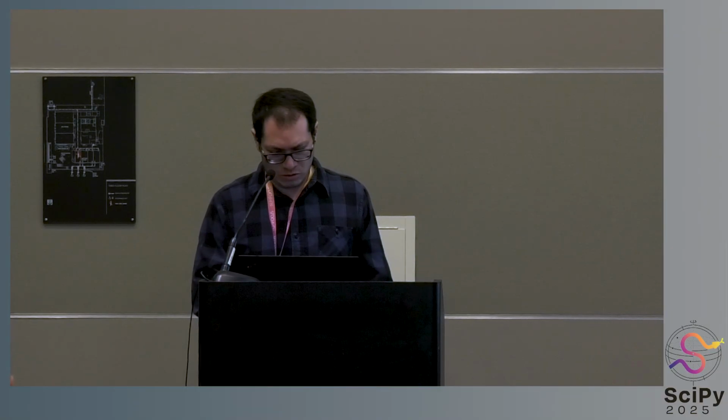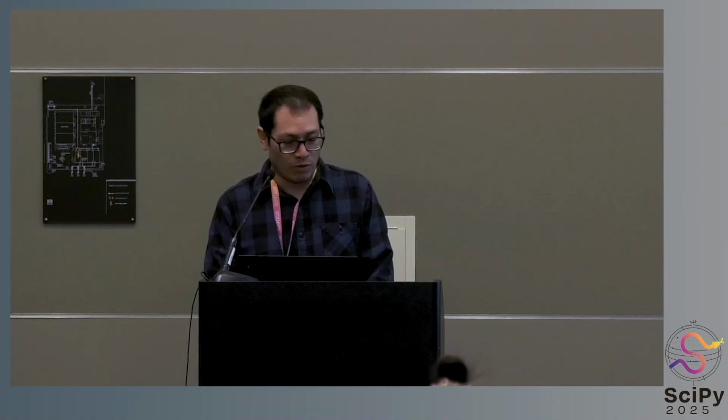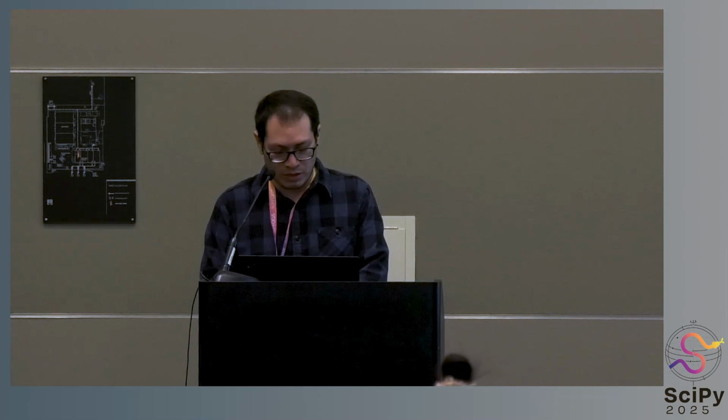And just to show that there is actually the full image that has been segmented, I'm just showing this. We didn't run the mask version, so it is the brute force of applying the inference. So we have some noise here. But for the actual pieces of the image that contain tissue, it is applying the function to that. So this is the whole image. I'm just pulling a downsampled version, but we can just open this in a viewer, and we could have a better grasp of this.